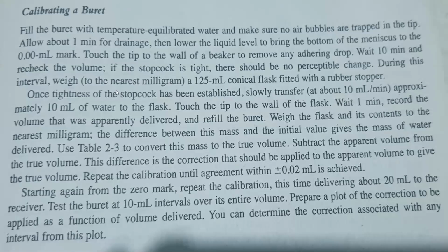I'll give you an example. The next step is just a repetition of the first step, because you should repeat your procedures. I'll give you an example. So for example, class, the volume delivered is approximately 10 ml. We actually call this the apparent volume.